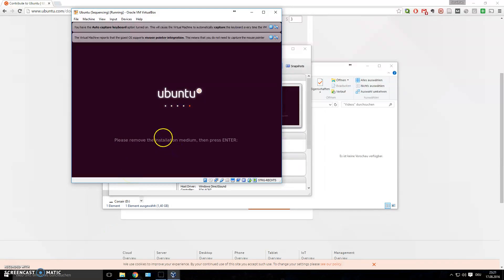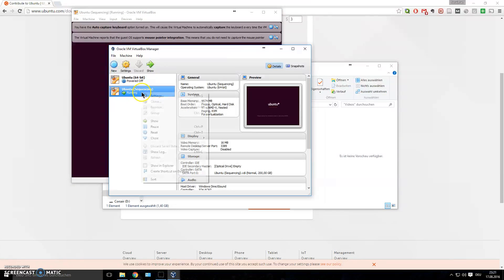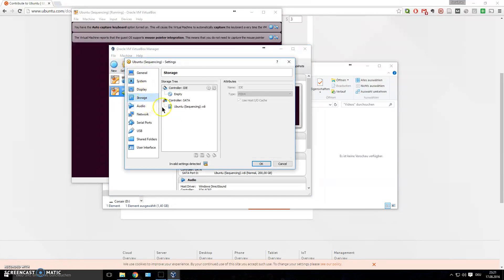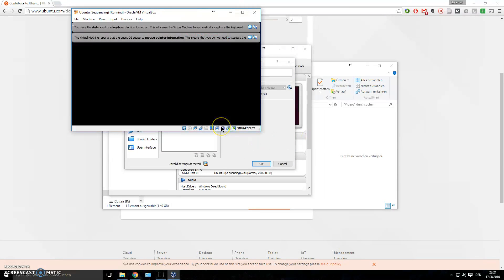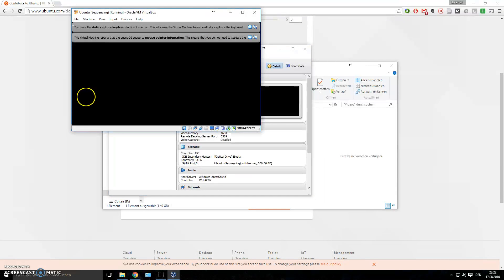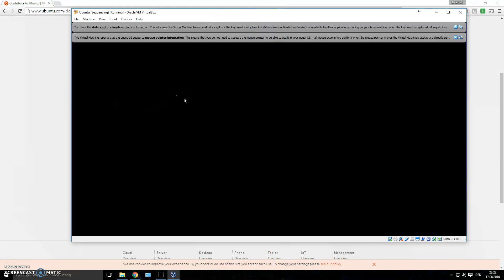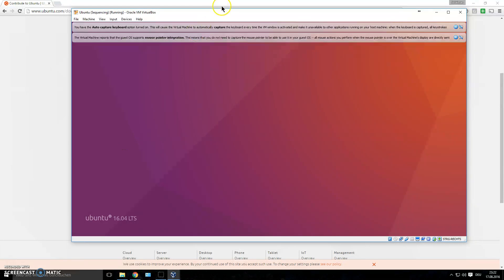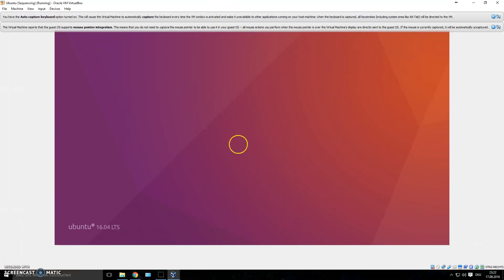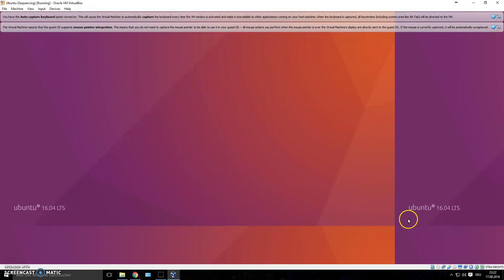The machine says to remove the installation medium and press Enter. I checked Settings > Storage and it was already empty, so pressing Enter is fine. It automatically removed the virtual CD. Here's the login screen — I named the user 'sequencing' and my password is also 'sequencing,' which is very insecure! You can go full screen to get a better feel for the environment, and the resolution should adjust automatically.